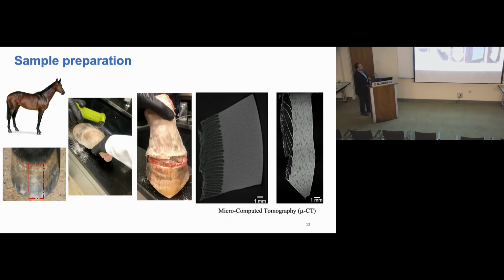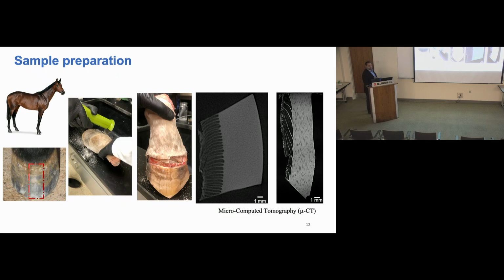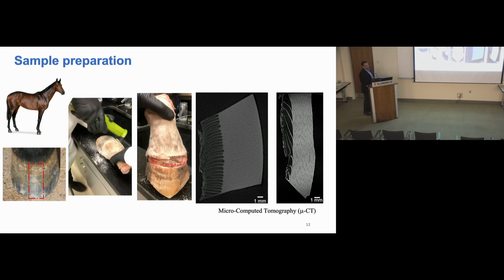So I don't know if this is offensive or not, but I will just show you how difficult it is to get the horse hoof out. And in the meantime, when you look at this, you will see how very tough it is to cut with a cutter. It's very, very tough. We spent about 6 hours trying to extract this. It is not easy to cut because of all the things that we mentioned before.